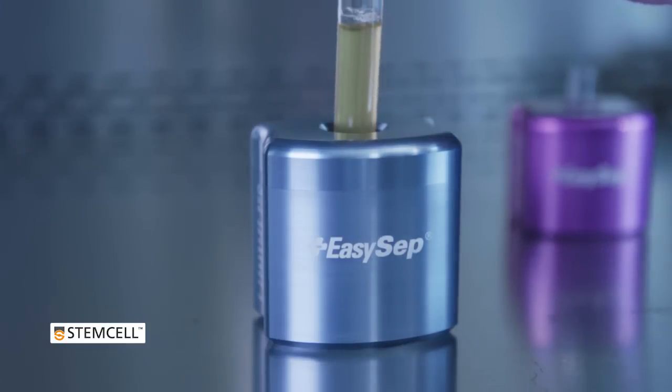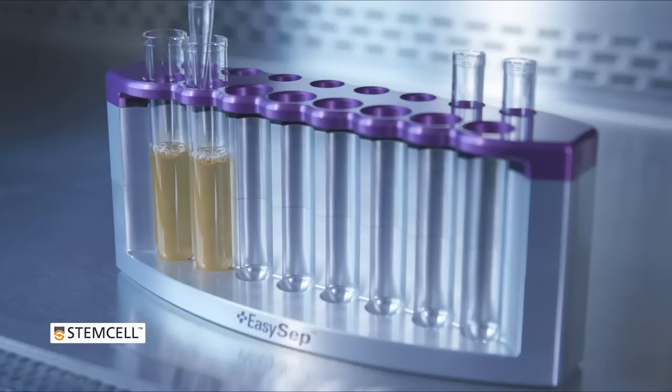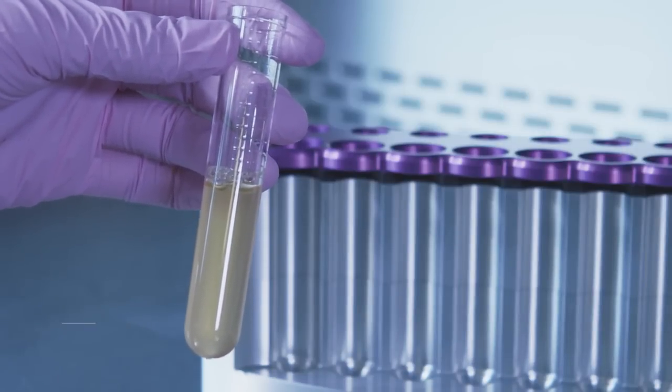Isolated cells are untouched, highly purified, and immediately available for downstream applications including DNA or RNA extraction, flow cytometry, or cell culture.